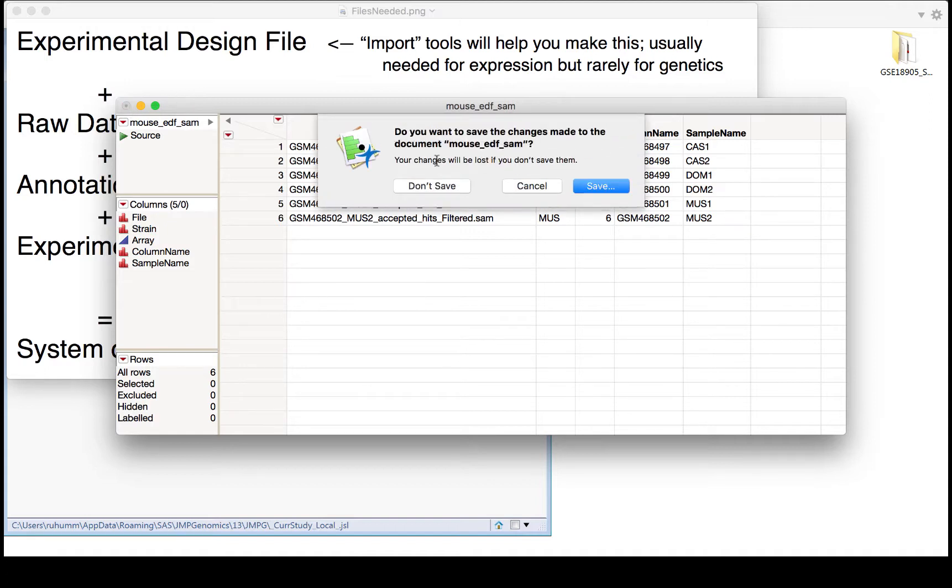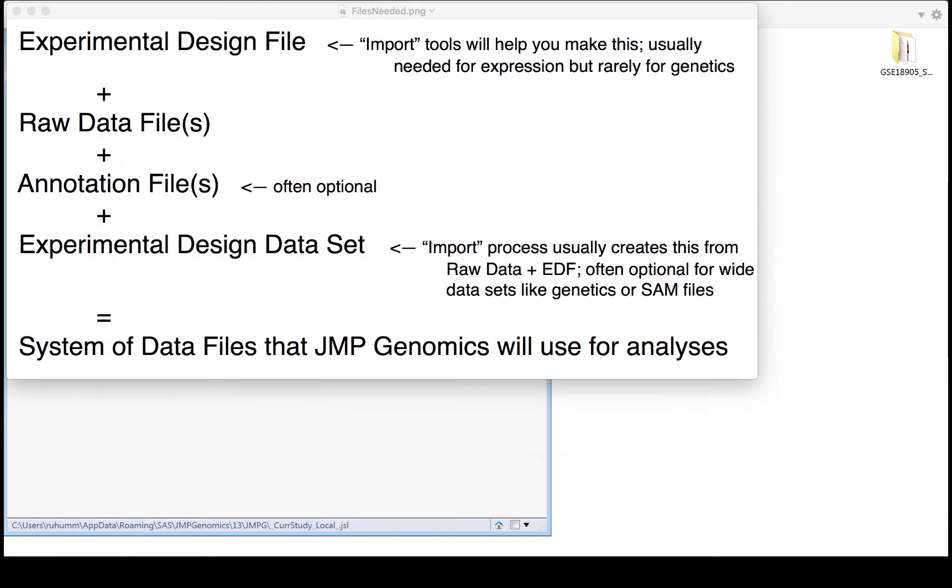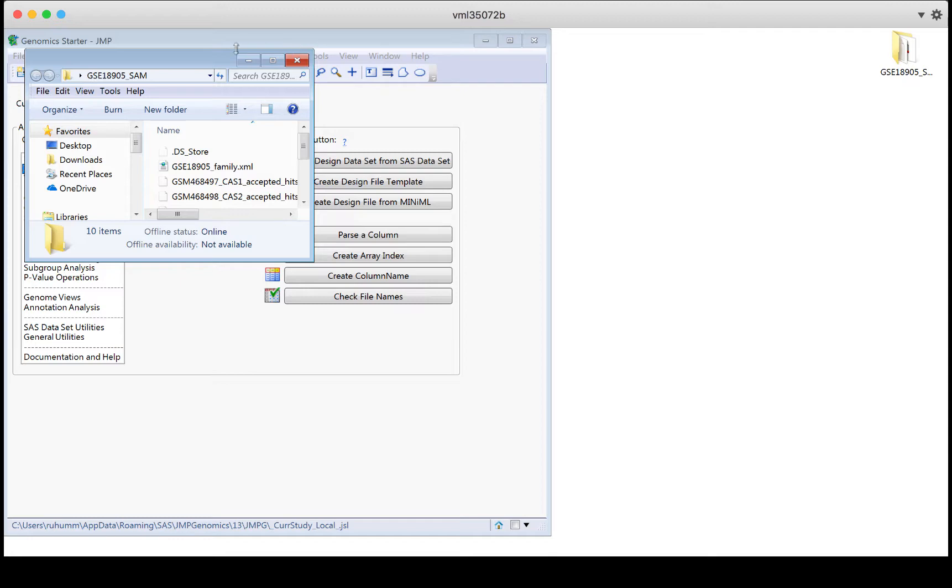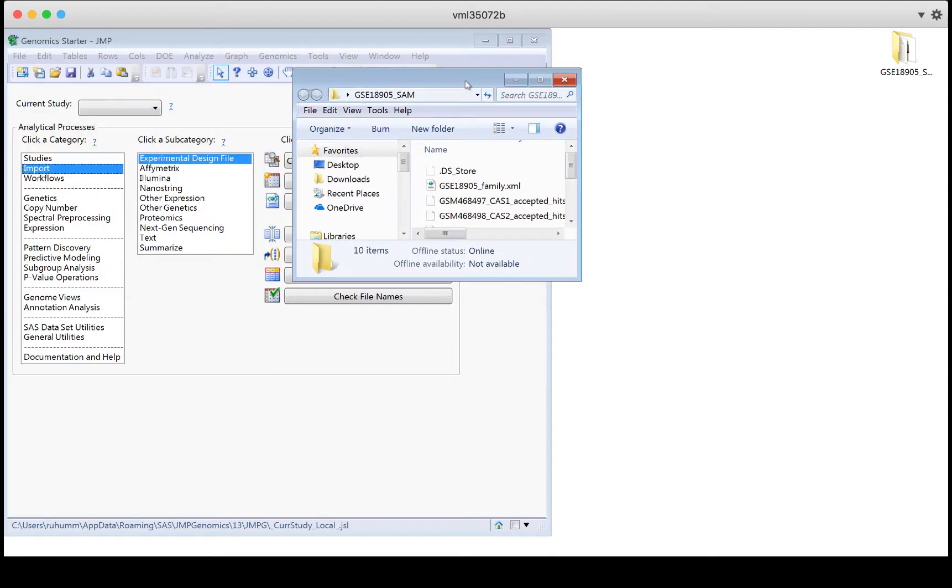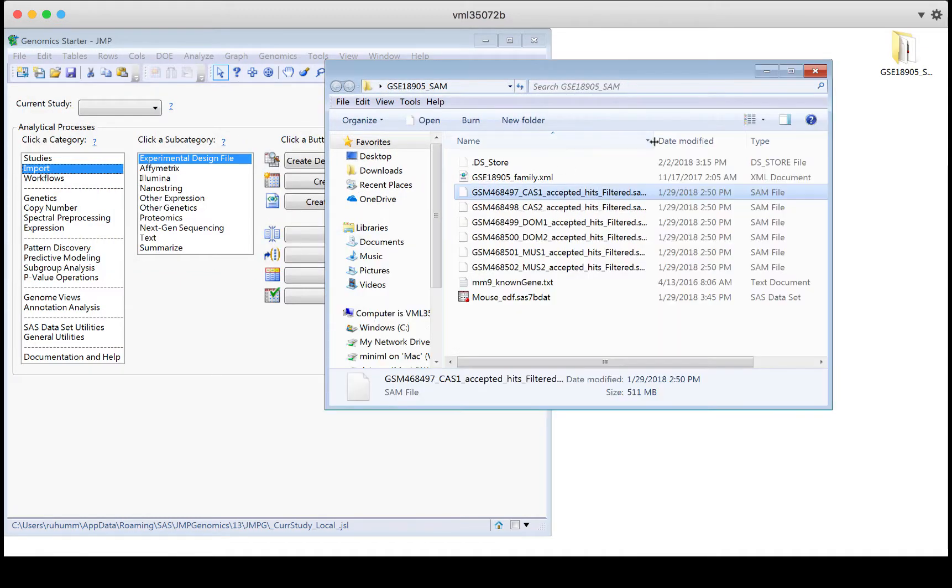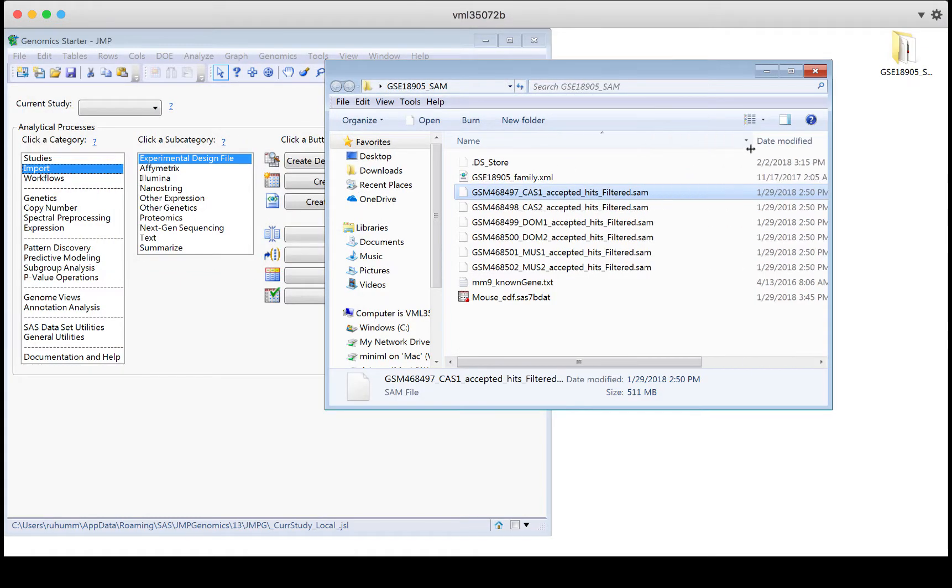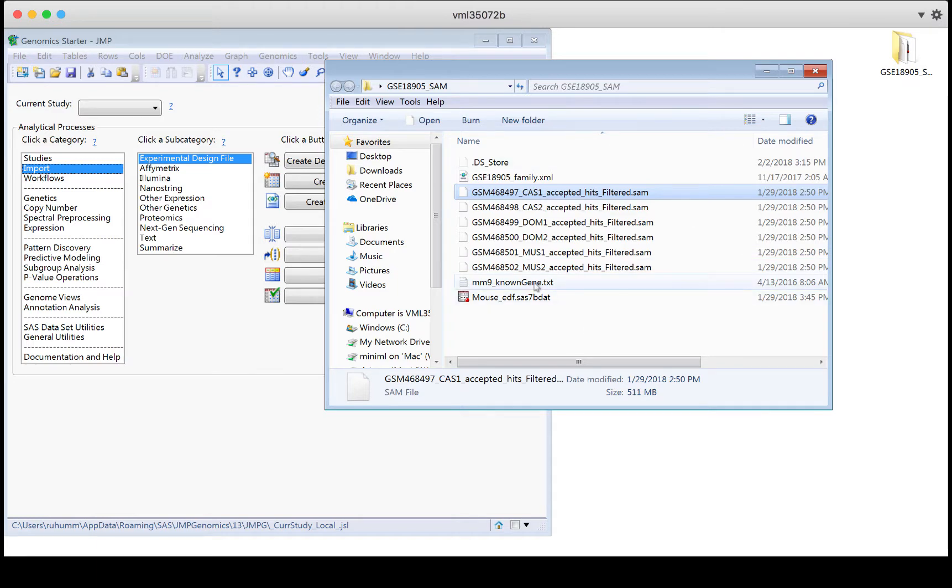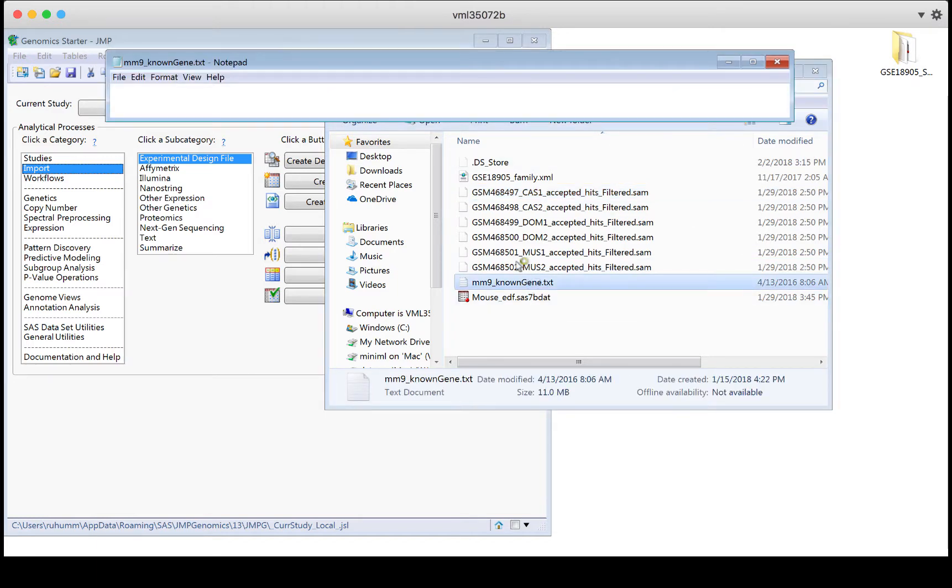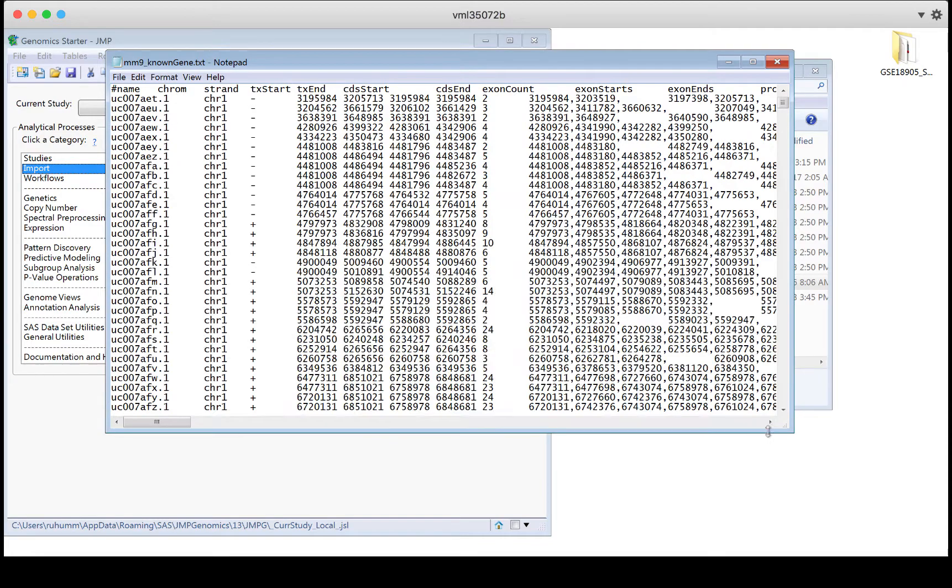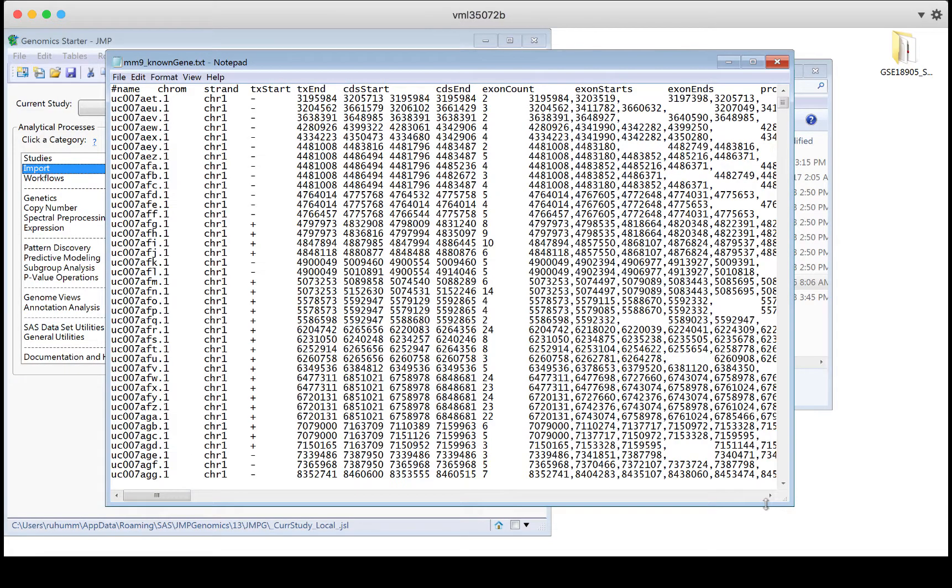Here are the raw data files for this experiment. The data files are these, the SAM files here for the six samples. The annotation file is here in this text, and it shows us information about where the transcript starts and ends and what to name that transcript.